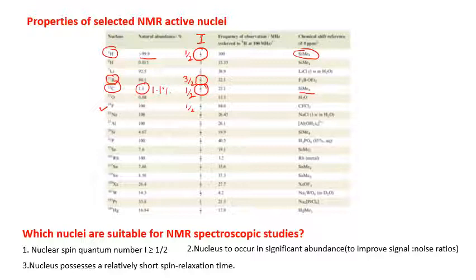For example, proton NMR refers to 100 megahertz. Compared to this, different nuclei are given their own radio frequency range. For example, if you set the radio frequency to 100 megahertz, it will selectively give the proton NMR signal; the other nuclei will not respond or give a peak. Similarly, if you change the radio frequency to a different level, then it will selectively detect 19F fluorine in the molecule, not proton NMR. So this radio frequency is selective for a particular nucleus. I will talk about this later also.